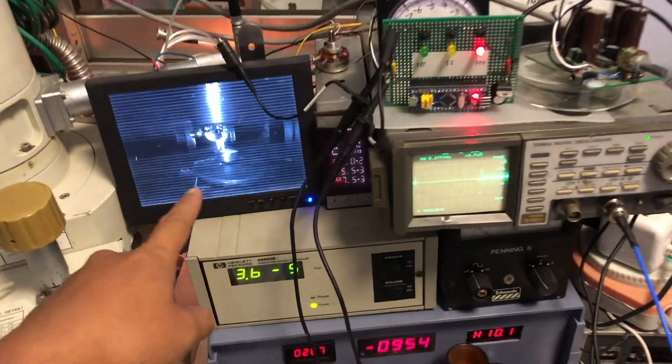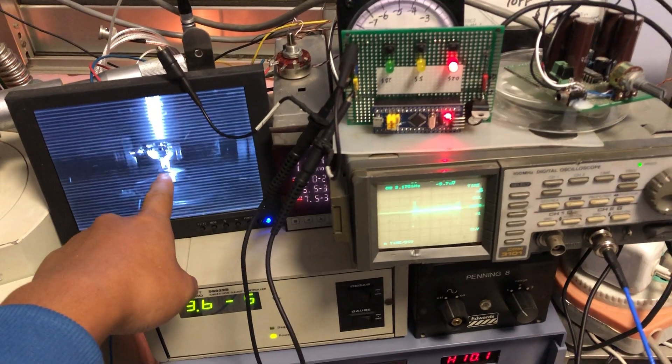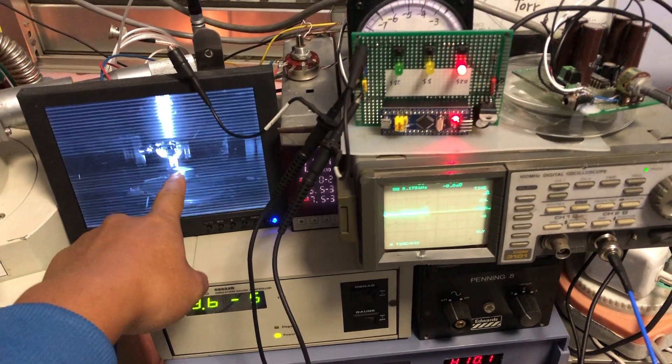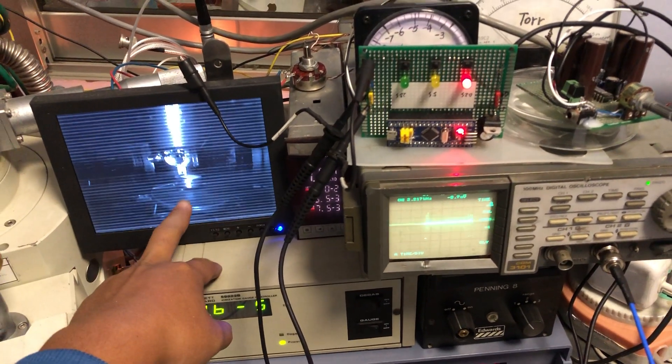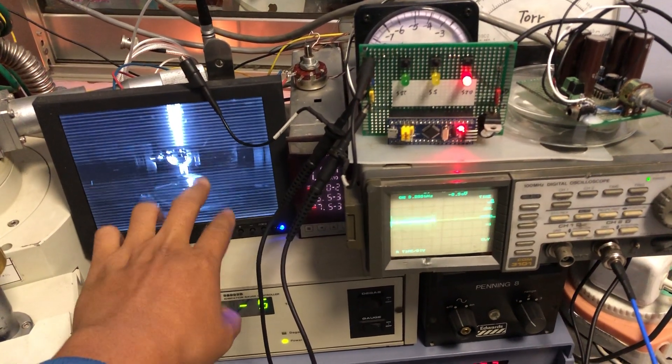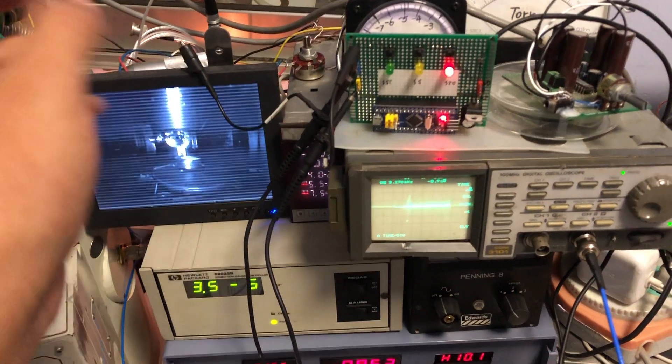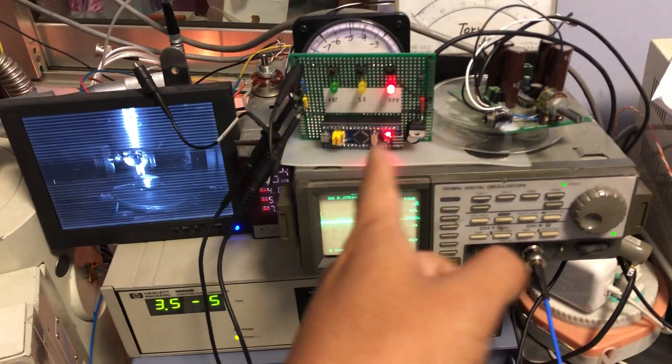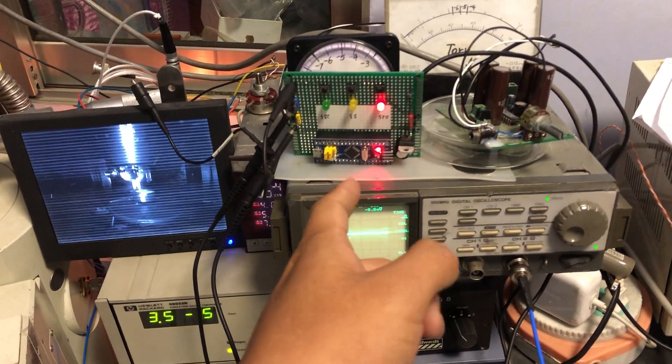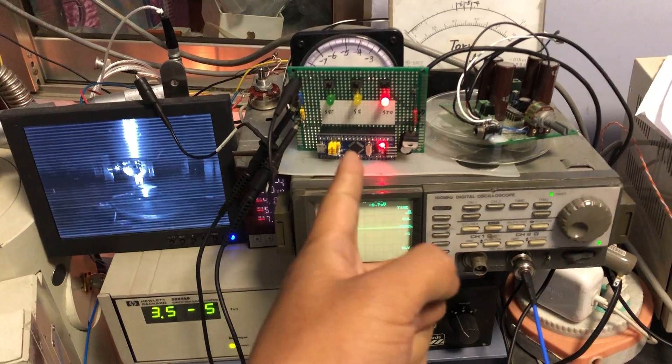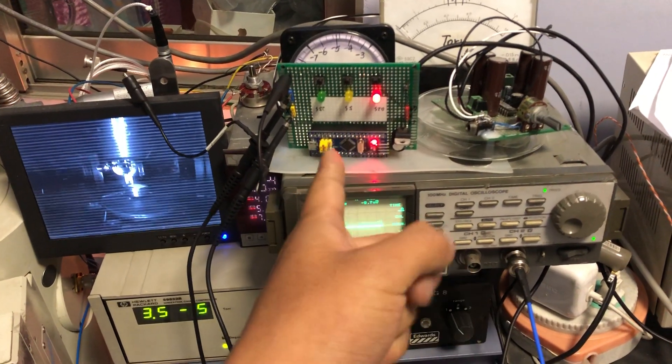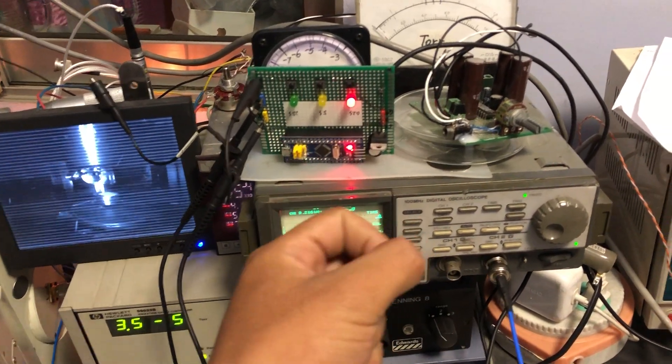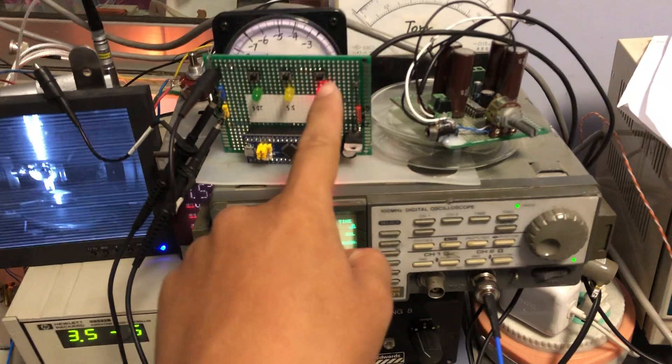...running an electron beam down through the sample. Nothing there actually. So here is a simple signal generator.